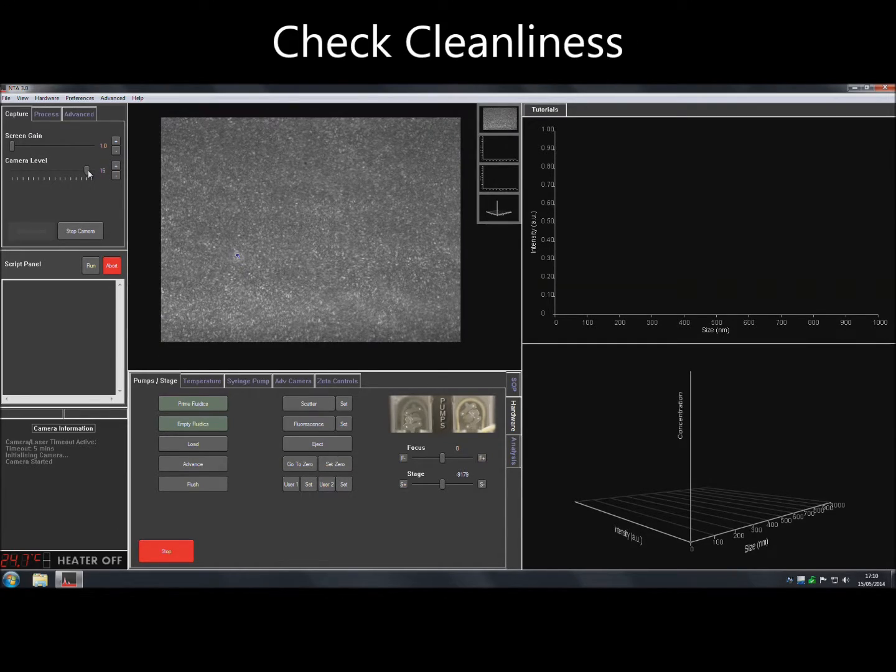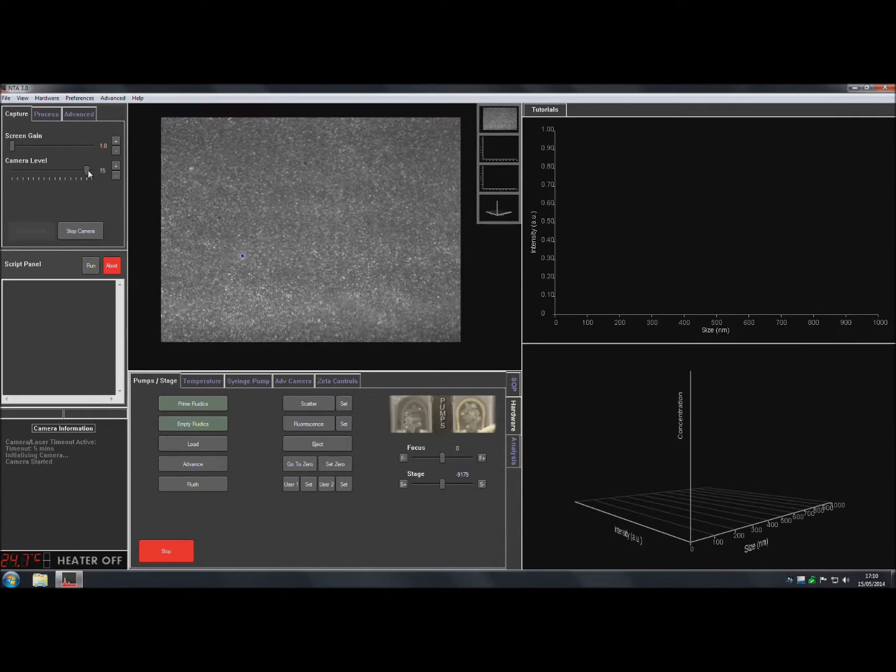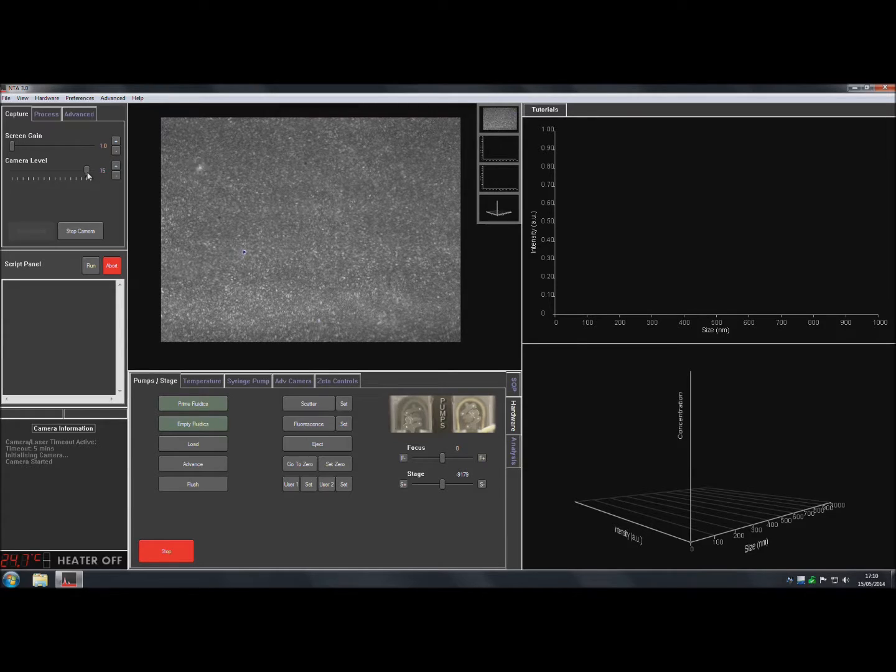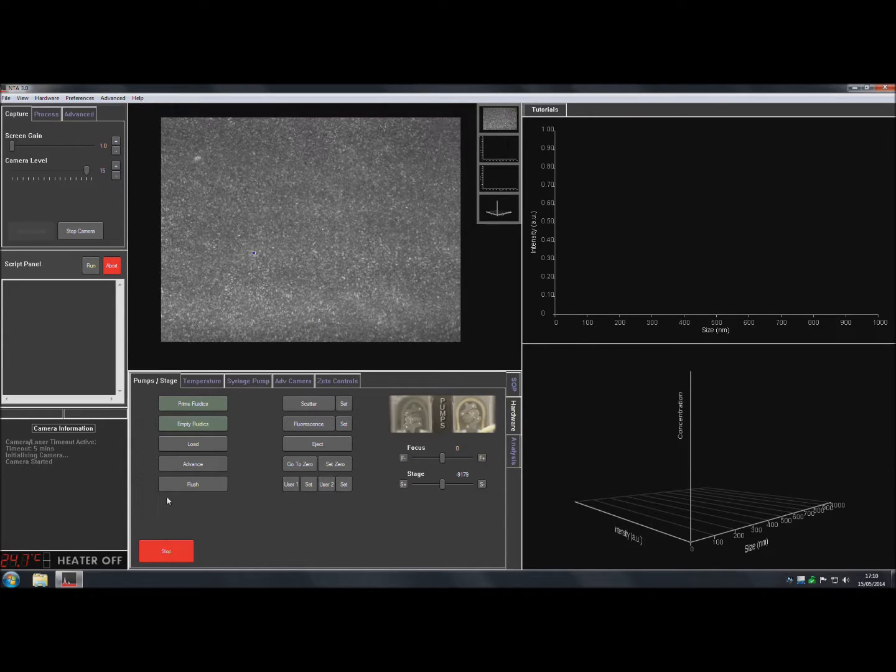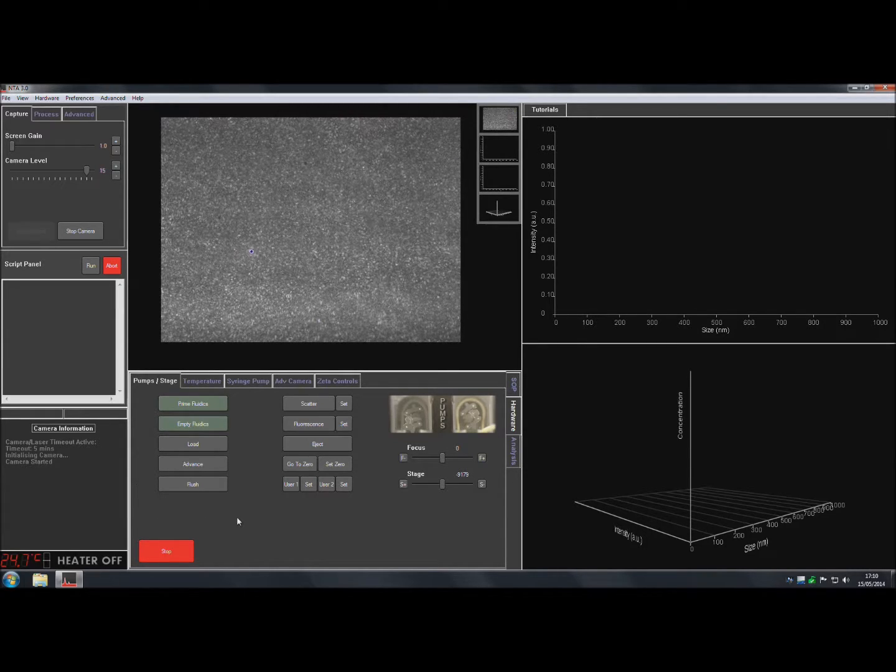At this point, check the cleanliness of the water that is being used for flushing. There should be less than 5 particles in the frame.